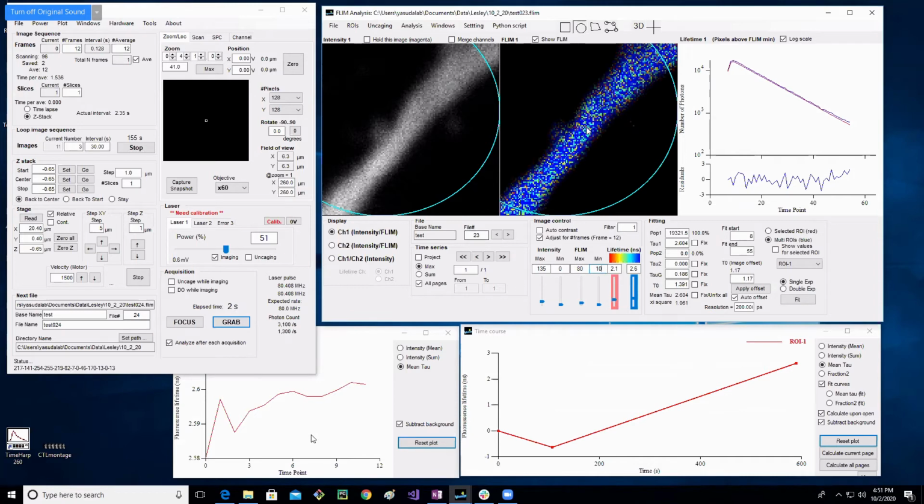But you do need to know that this value will affect your data, so you should pay attention to it. These other values, the top value of FLIM, for example, don't affect your data analysis. It will affect how the image looks here, but not your analysis. For intensity, however you set these values doesn't change your analysis at all. It just changes how it's displayed. So you can set them however you want without worrying about changing your analysis.